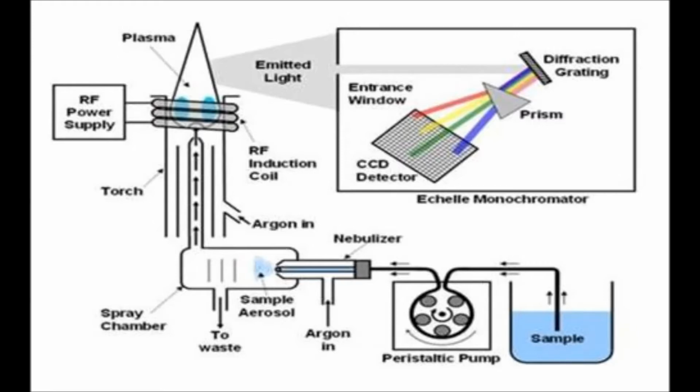The ICP instrument is essentially just a flame test. Okay? You're all familiar with the idea of fireworks. In fireworks, we put metal compounds, metal salts typically, with the explosives, and when the firework explodes, the high temperature causes the elements from the metal salts to emit characteristic colors based on the identity of the metal inside. So, for example, lithium glows at a pretty reddish color. Potassium gives you a purplish color. Magnesium actually gives you a very nice bright white color. And boron glows a nice green color.